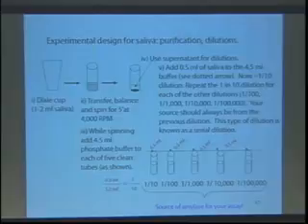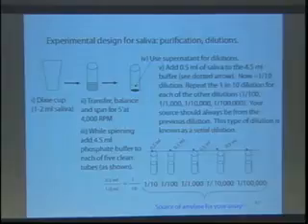Okay. The shortest length of time we had was 5 minutes for a new centrifuge. They weren't put in balance. They got off balance and literally broke the rotor shaft. So make sure they're balanced. You're going to get a pellet. I call it oral debris. I don't know what it really is. It's white. It's plaque, bacteria, pieces of Oreos. I don't know, okay? But ignore it. That's not what you want.